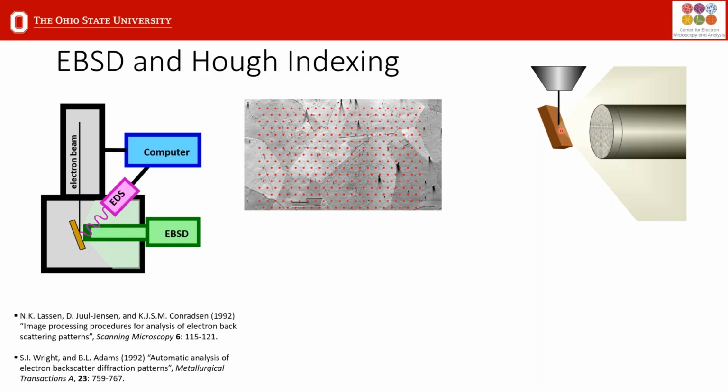The reason is that the beam travels through a bigger portion of the crystal, and you get dynamical anomalous absorption effects that change the band contrast. So 45 degrees will reduce the signal, and it might result in band contrast inversions that will make your EBSD analysis very, very challenging. The flatter analysis results in an improvement in the spatial resolution, but at the cost of decreased signal.